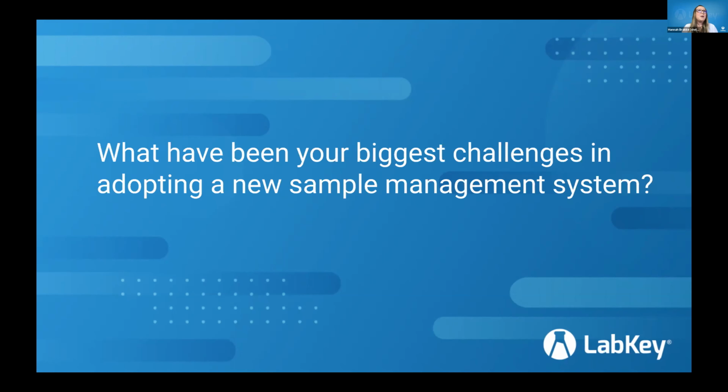Somebody mentioned that they've got a lot of samples, and are there practical performance limits or numbers generally in the freezers? So far the answer is no, we haven't hit this. We do a lot of performance testing on our own, but we also like to interact with our clients and understand the types of data and the amount of data that they have, so we are able to support you in that.